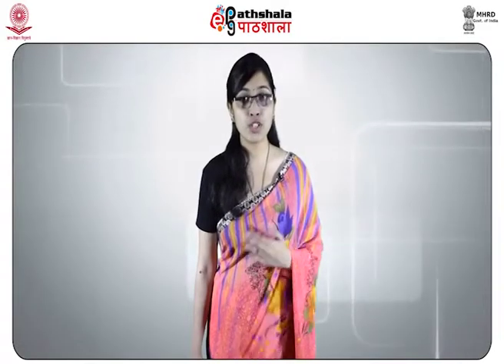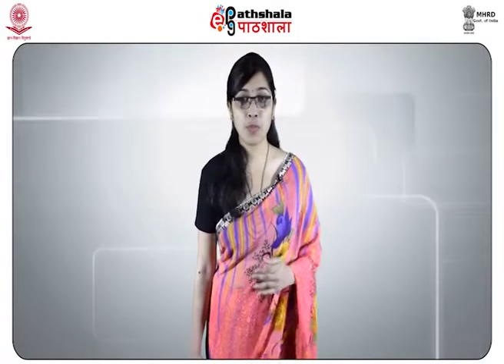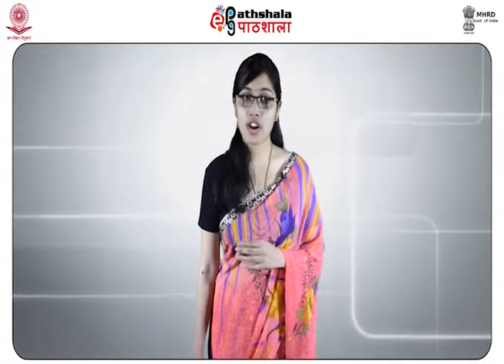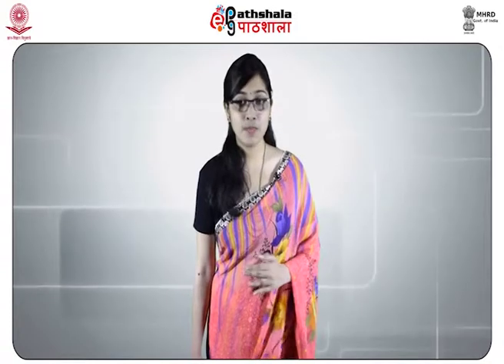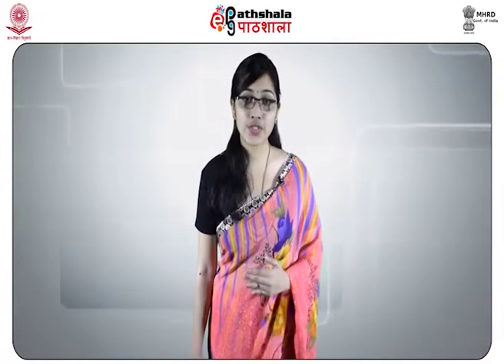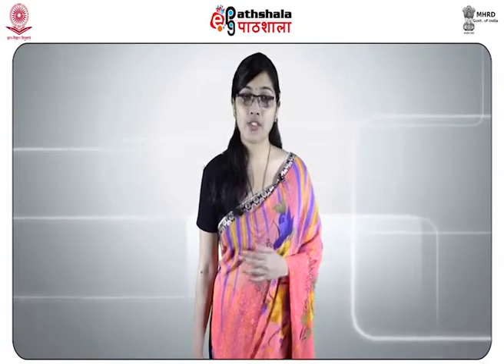It is possible to say whether the hairs have been pulled out, cut or fallen. The pulled out hairs have live bulbs and signs of stretching near the bulb, while the fallen hairs have roots that are shrunken.